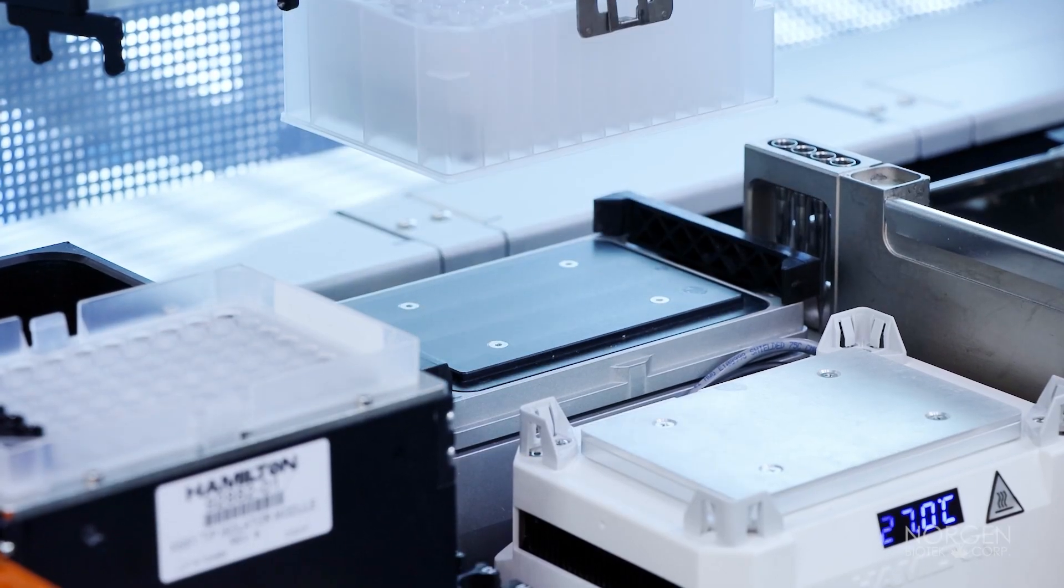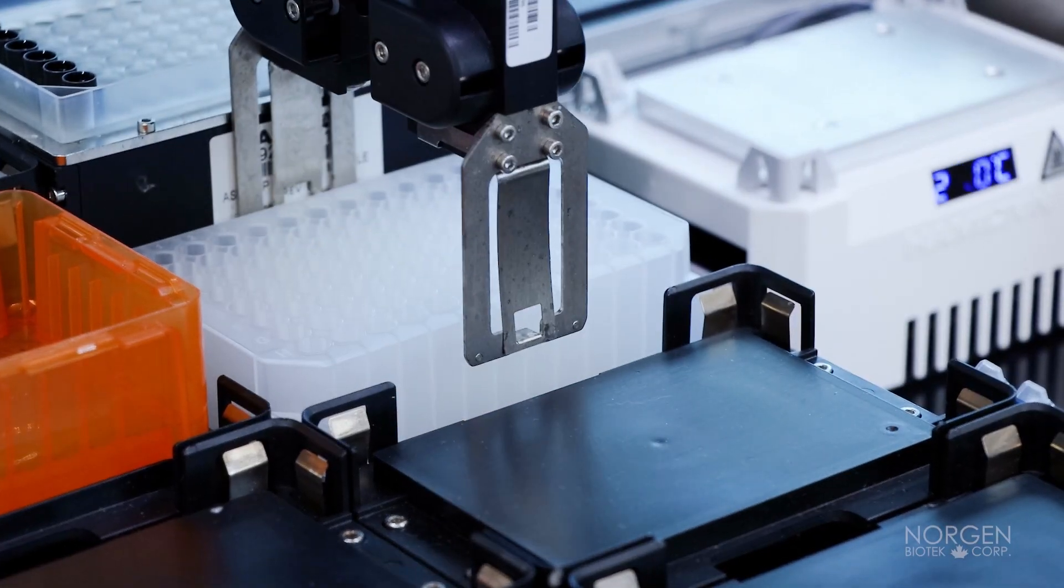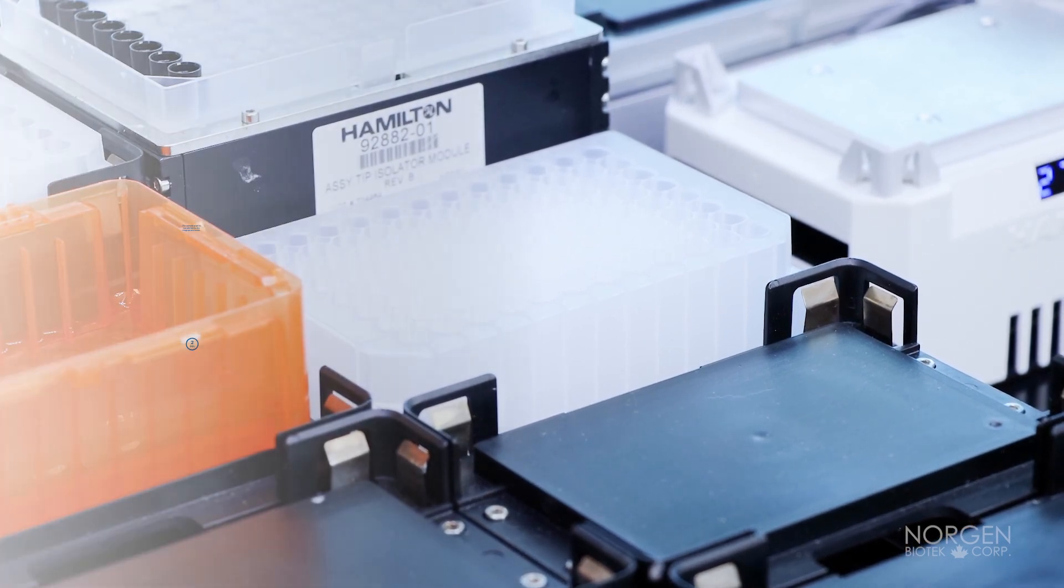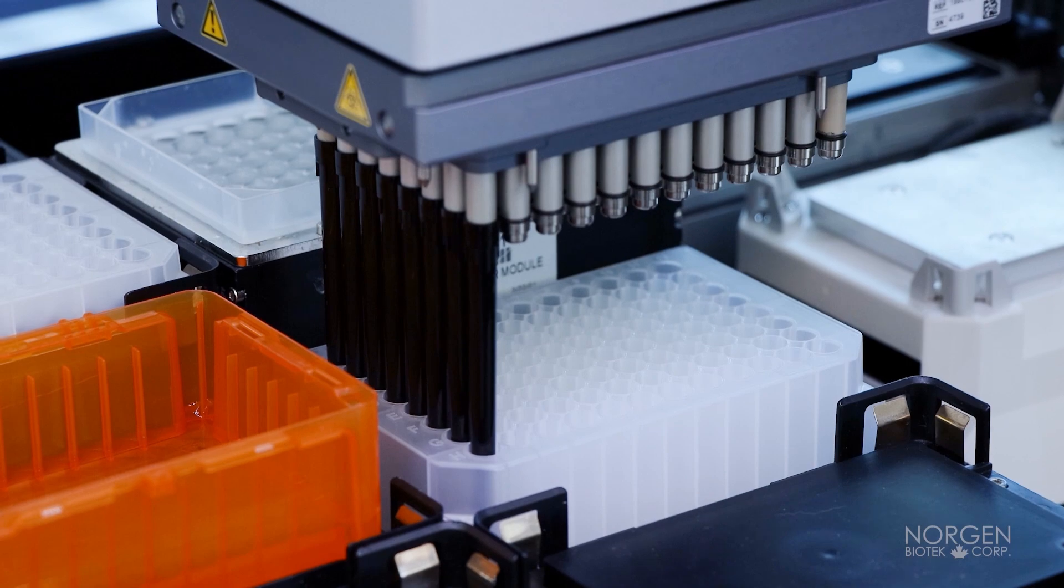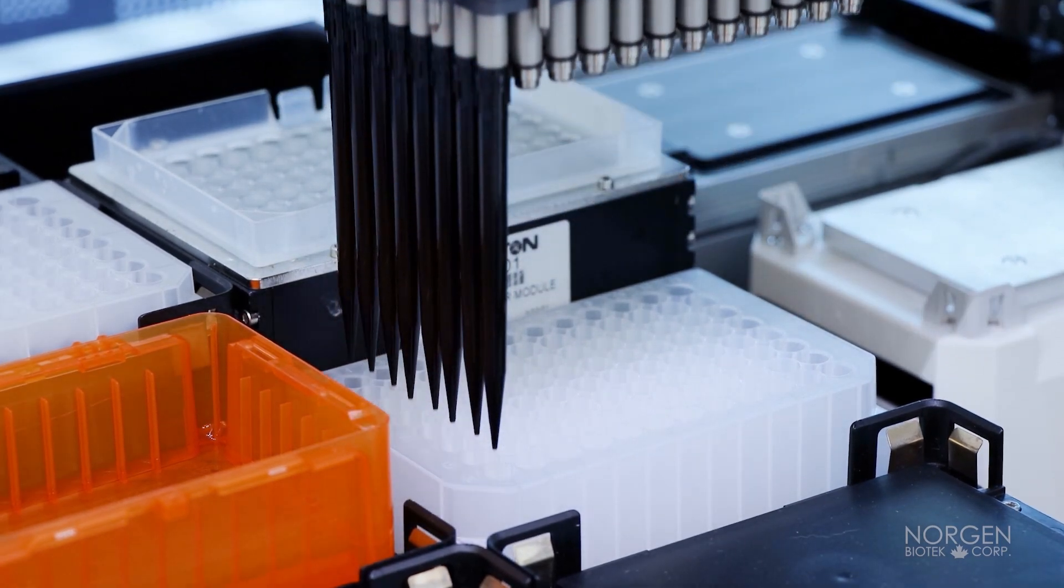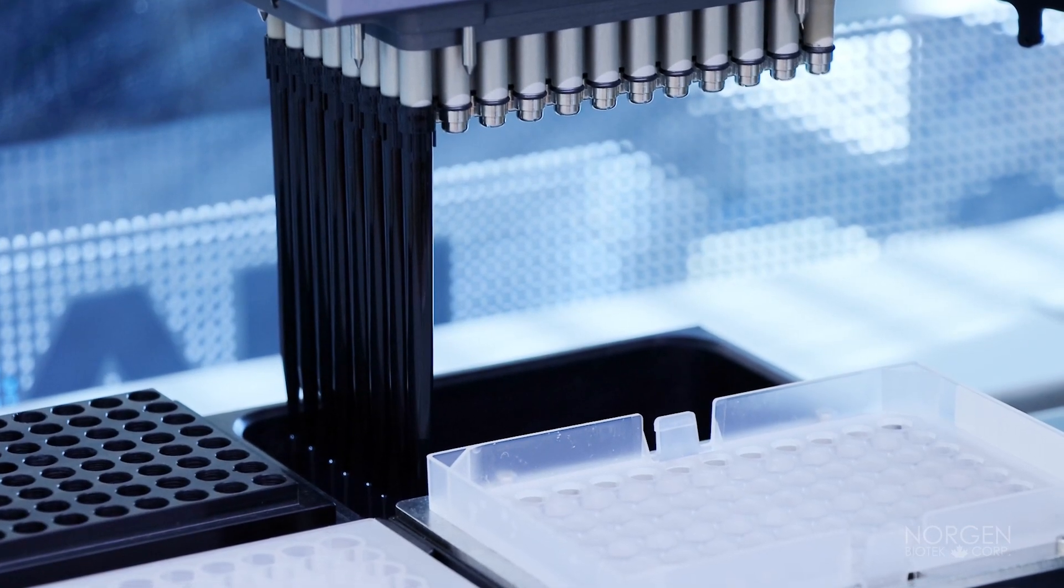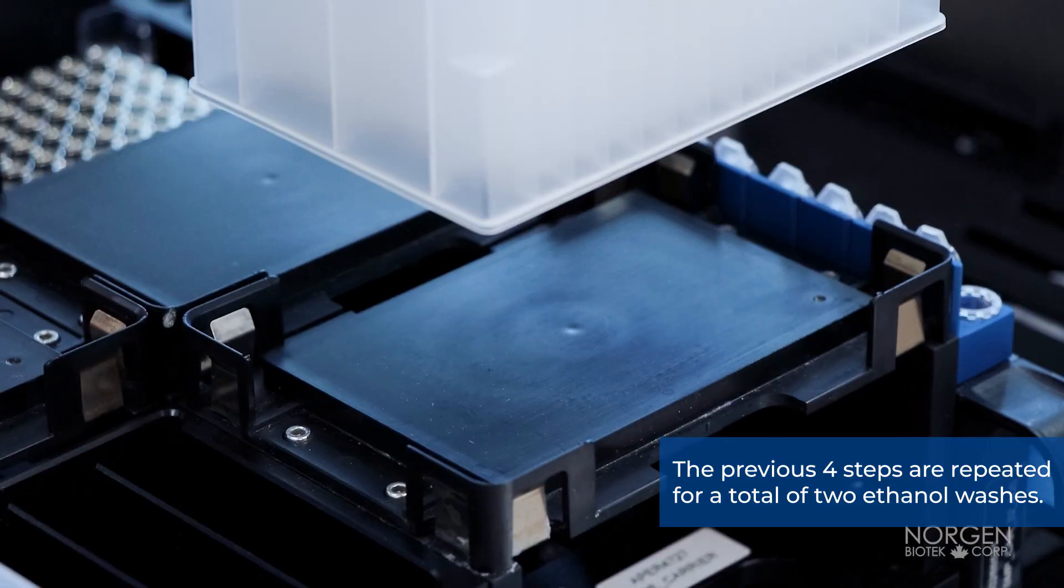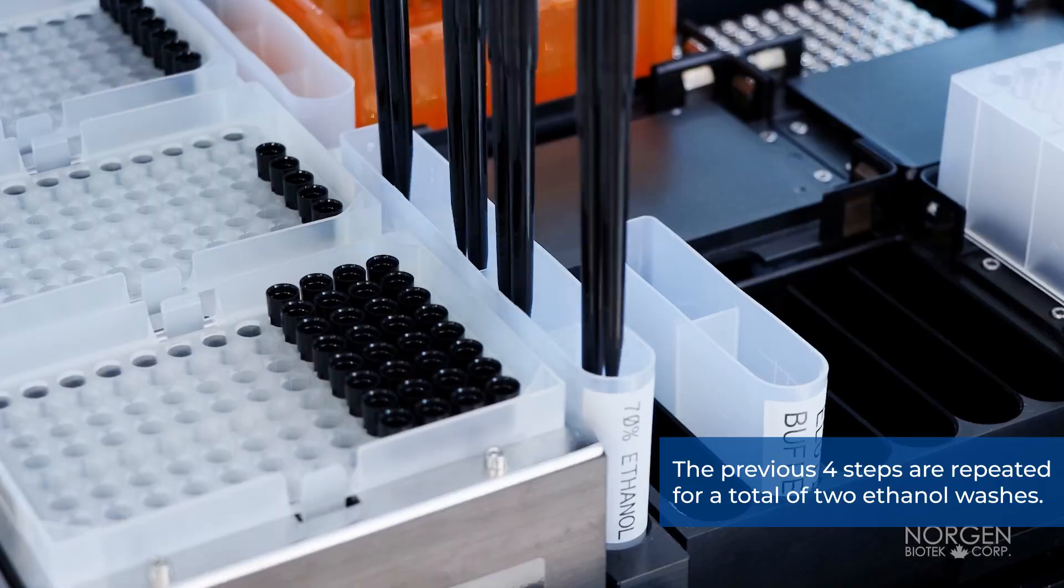The sample plate is transferred to the magnet and waits for 2 minutes to pellet the magnetic beads. The ethanol is removed from the samples and deposited into the gravity waste. The previous 4 steps are repeated for a total of 2 ethanol washes.